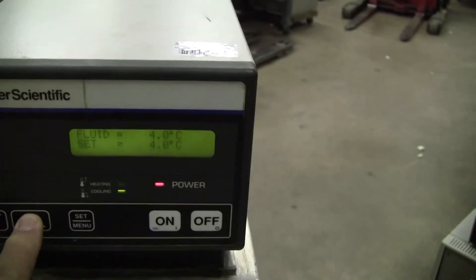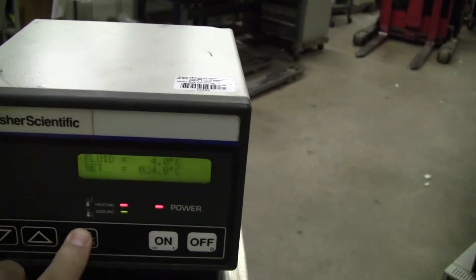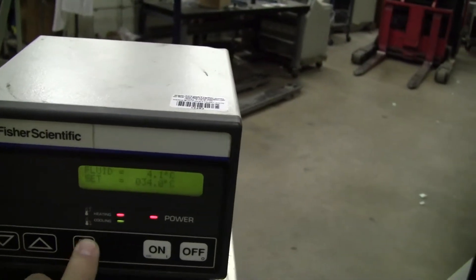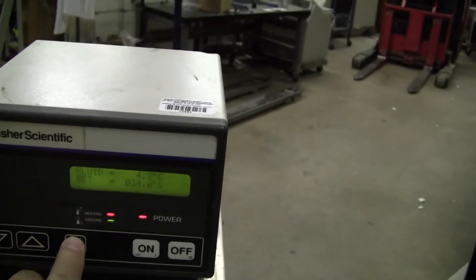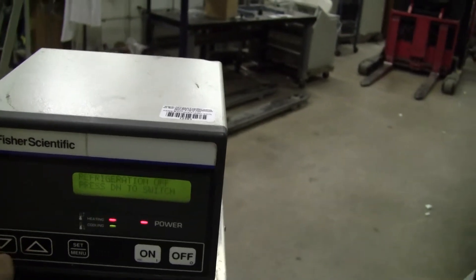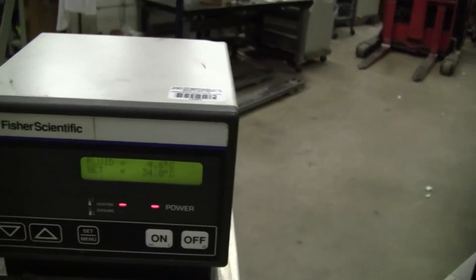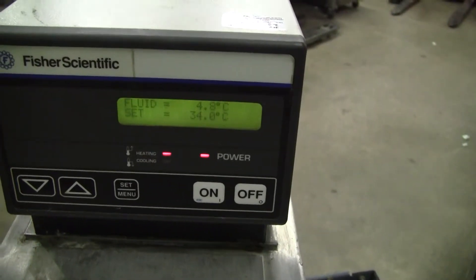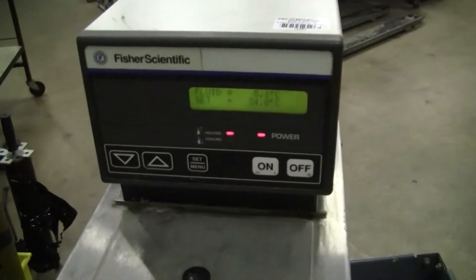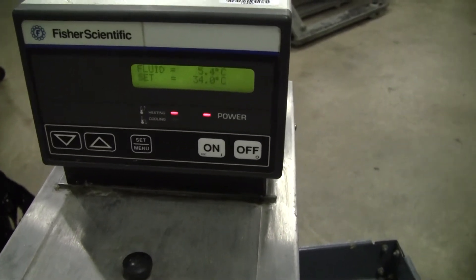Let's move it on up and see it heat a little bit. Set it at 34. Now you have it heating — see, it's going up steadily.